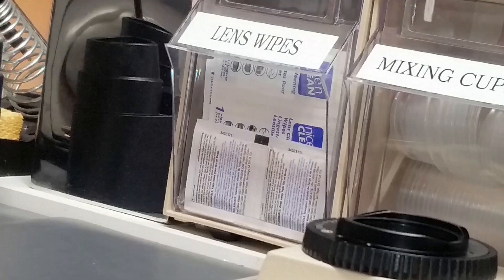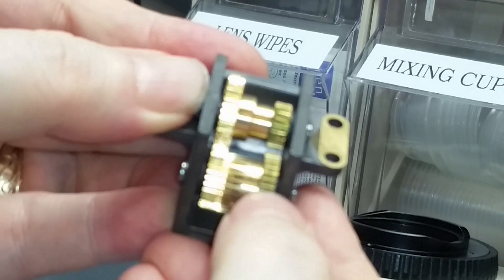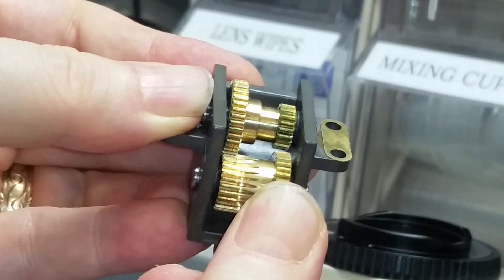Now this gearbox is typical of what you'll see on an eBay scope. It's very stiff as you can see. I can just barely rotate this. It's all I can do to rotate this without the skin coming off of my thumb, to be honest. It is very stiff.